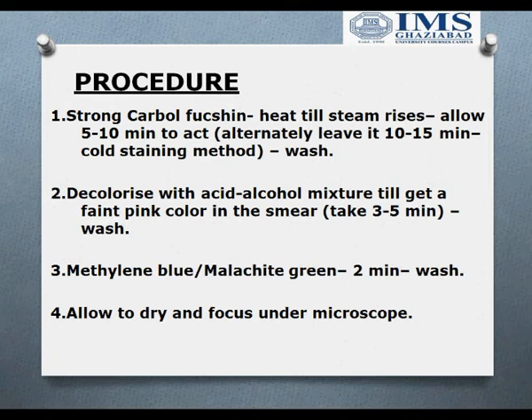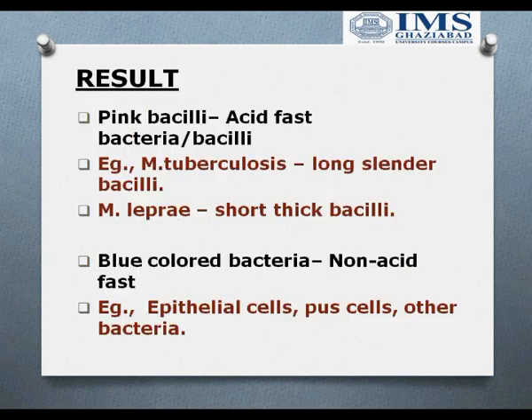Then after, we will wash the slide. After washing, we decolorize this with acid alcohol mixture till we get a faint pink color in the smear. Here we will take 3 to 5 minutes, and after that we will wash it again. After washing, we add methylene blue or malachite green. We will retain it for 2 minutes and then we will wash again. We will heat and dry it, allow it to air dry, and focus under the microscope and study.